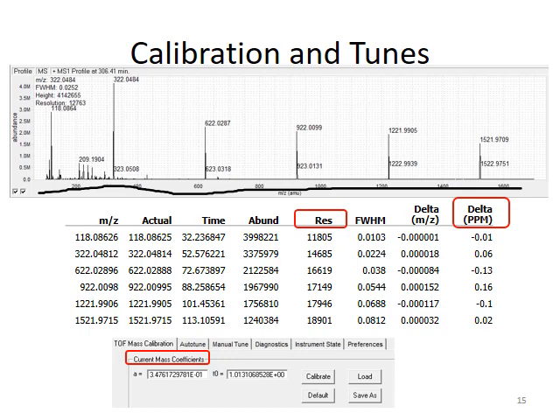Because the mass range was set between 50 and 1700, you will see 6 typical analytes. On the basis of each analyte, the software will calculate resolution and also accuracy in this table.